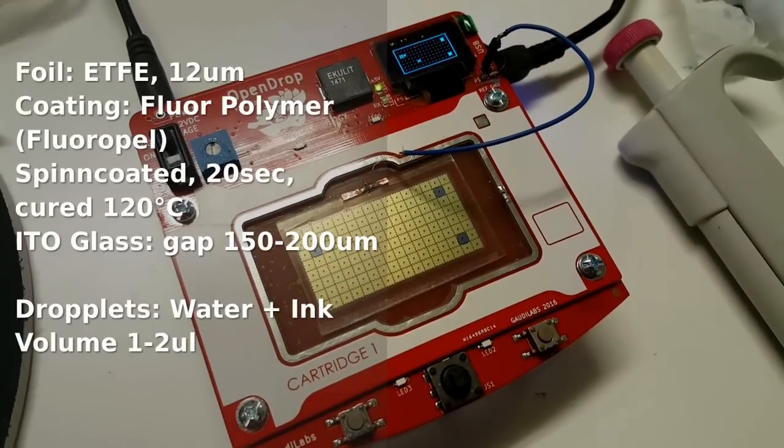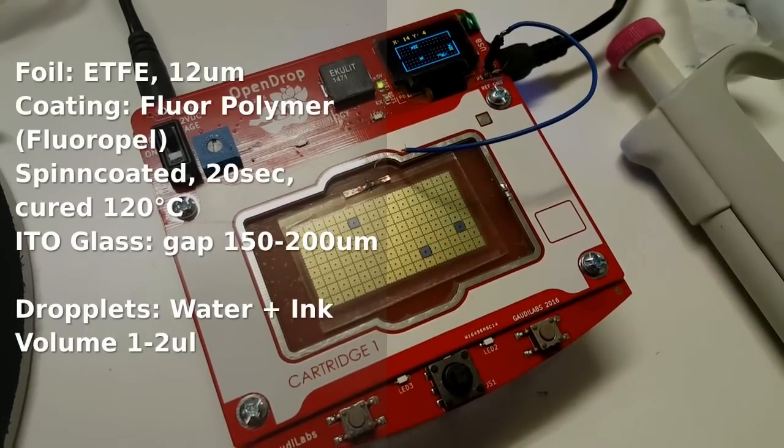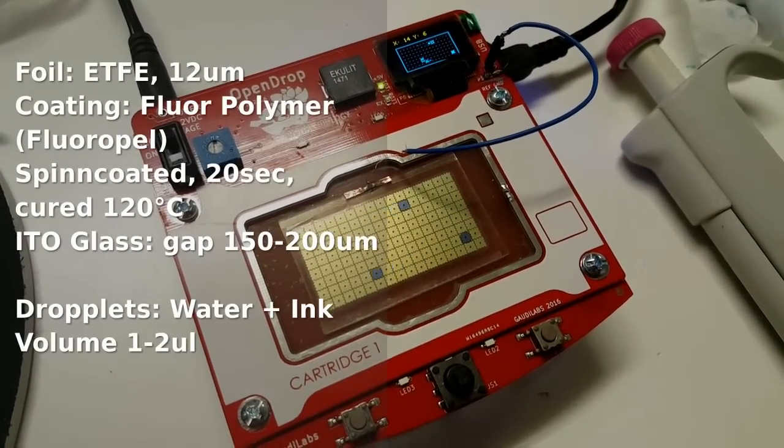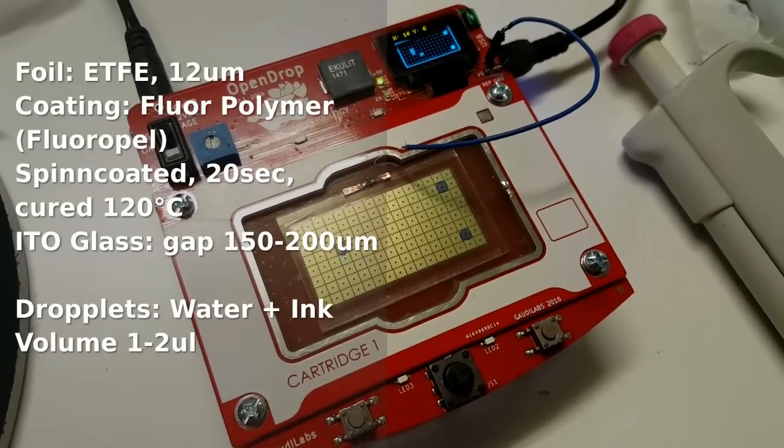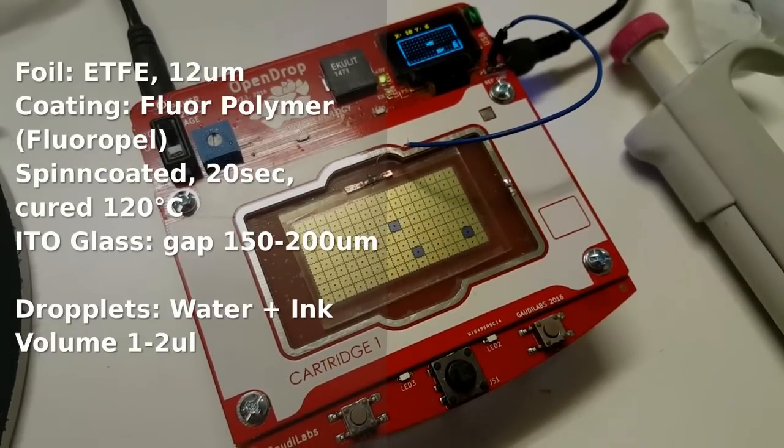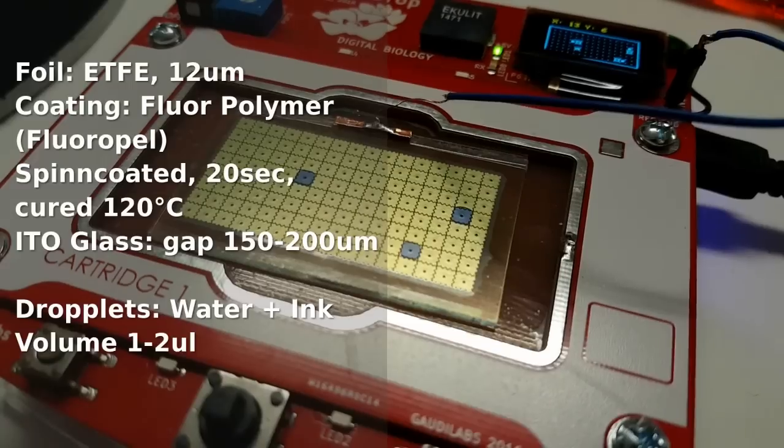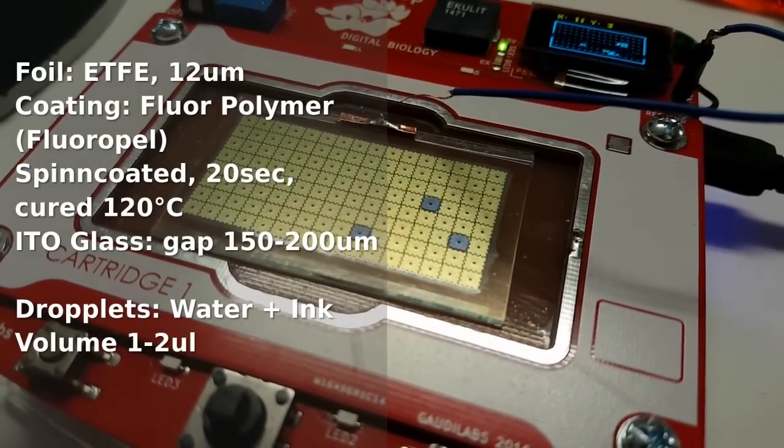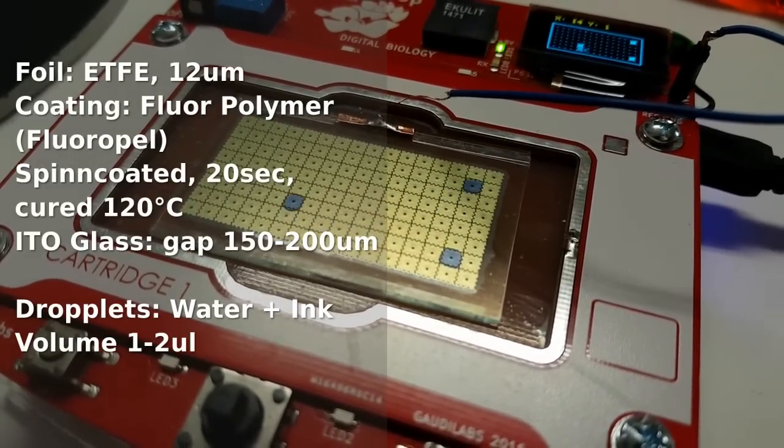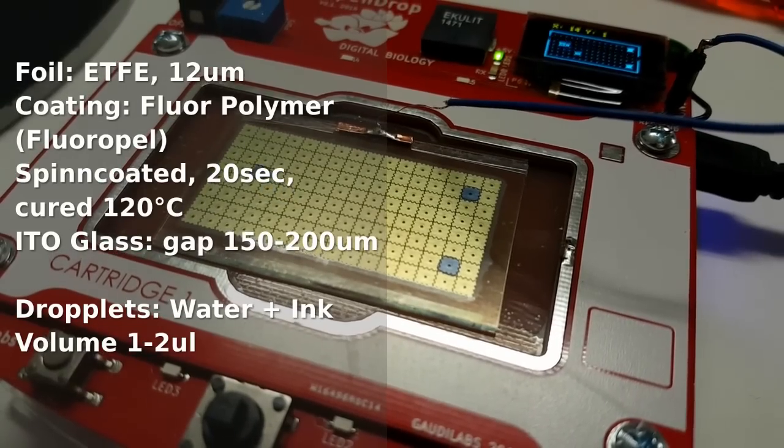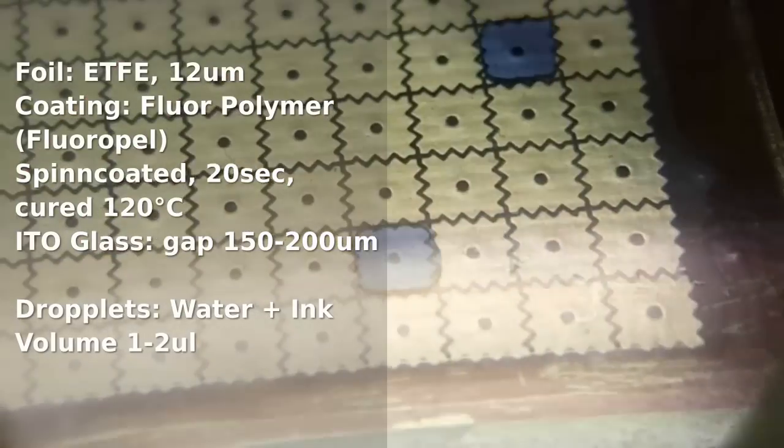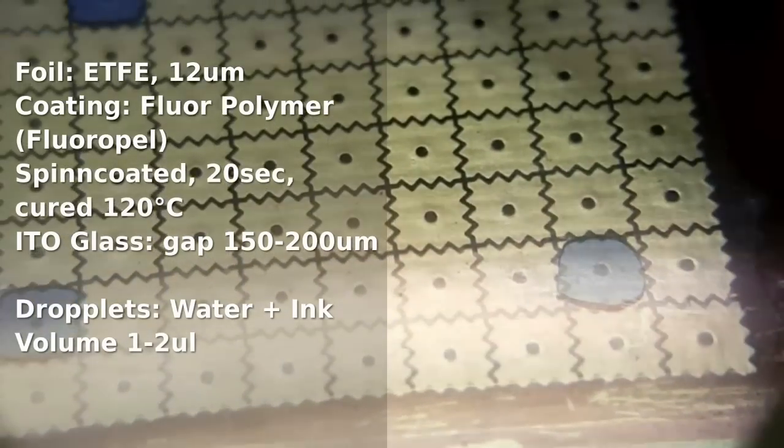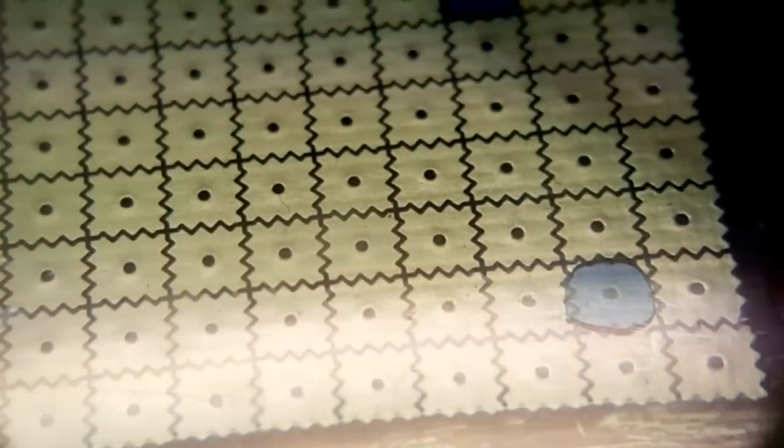The setup that I use in this video is a foil ETFE 12 micrometers coated with a fluoropolymer that I spin coat 20 seconds at about 4000 rpm, then cured at 120 degrees Celsius. The ITO glass is also coated with the same material and the gap for the liquid is about 0.2 millimeters, which gives a droplet volume of 1 to 2 microliters and I just use water and ink.